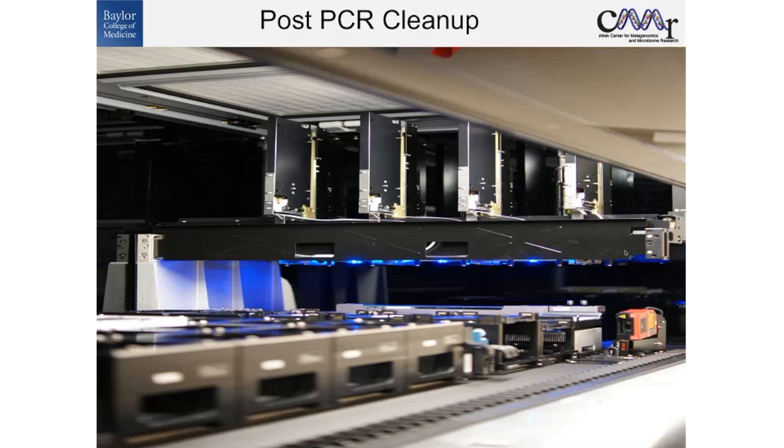So in addition to the bead cleanup on this instrument, we carry out the PicoGreen, so to quantify our amplicons. Once those are set up, they're taken off deck and read on a plate reader. That information is then fed back to the robot, which calculates how much of each of the amplicons should be added to the pool. So we want to normalize so we have a good even distribution of signal among the various members of that particular pool. And so you could imagine that's quite laborious with 400 different samples going into an individual pool.